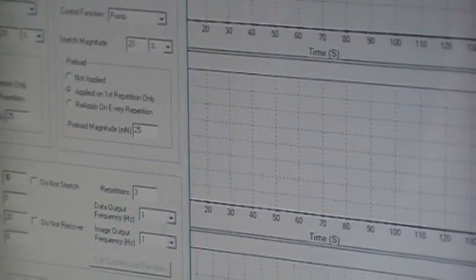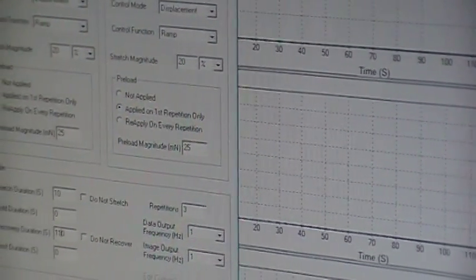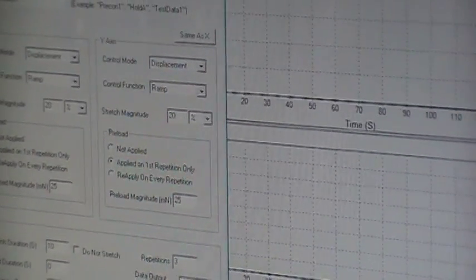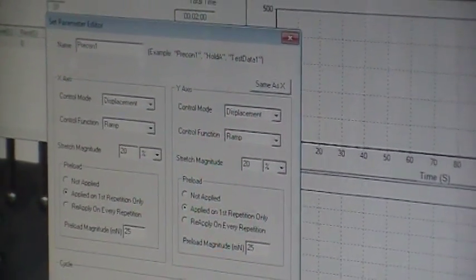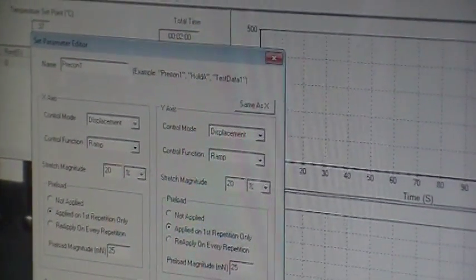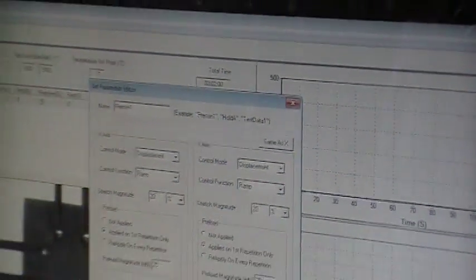Otherwise you will be damaging the load cell. Well, you won't damage the load cell, not within the ranges you would reach within this type of sample. But at some point, you can't trust the load cell readings above the maximum range, and at some point it will saturate. So you might be able to get a reading up to 2300 millinewtons maybe with these, but anything above 1.5, I would consider an untrustworthy data point.